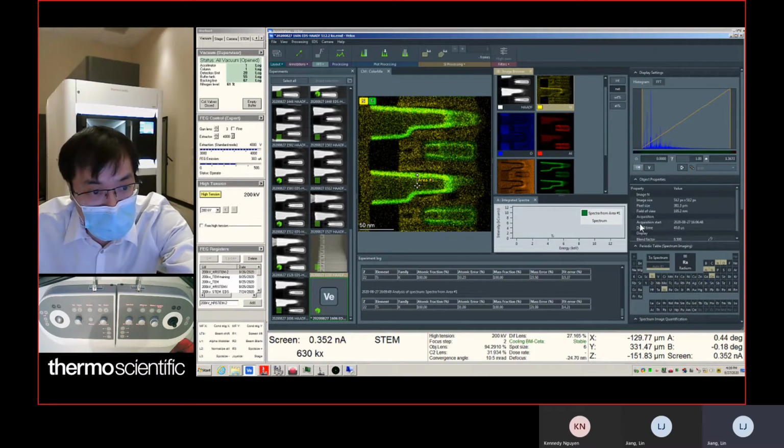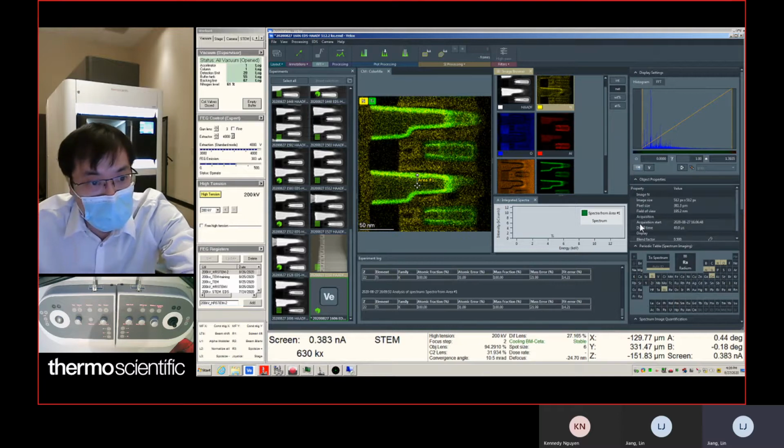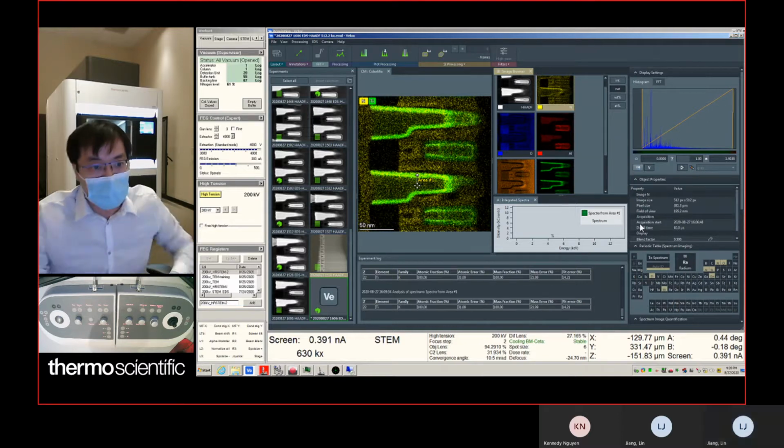T7, 8, 9. Okay, let's upload after then.